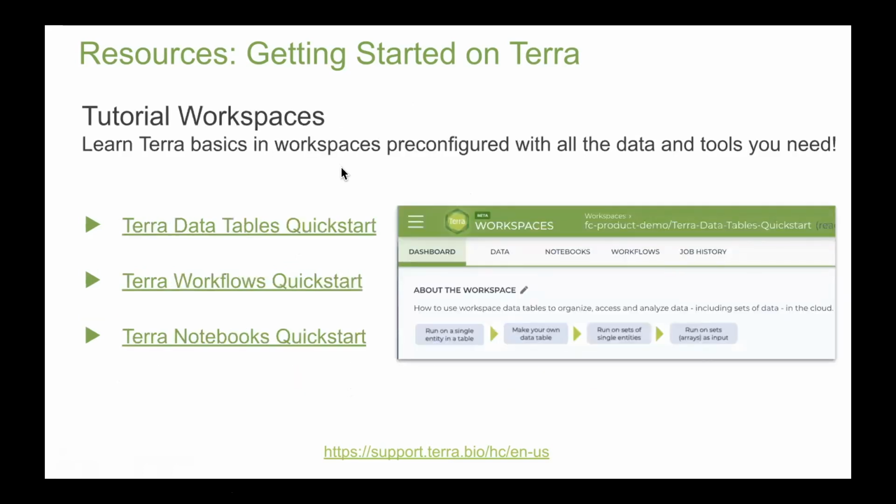We also have some great tutorial workspaces. These are workspaces that you can go in and get hands-on with Terra, similar to what you did today. They're exercises that walk you through some really basic concepts of working with different Terra features. And they are designed so that they literally will only cost you pennies to run. So if you have a billing project, it shouldn't use up too much money to run it. And again, you have access to this temp one today, so please feel free to go in and play around if you'd like to play around with any of these. We have ones dedicated to data tables, to our workflows, and also to Jupyter Notebooks.